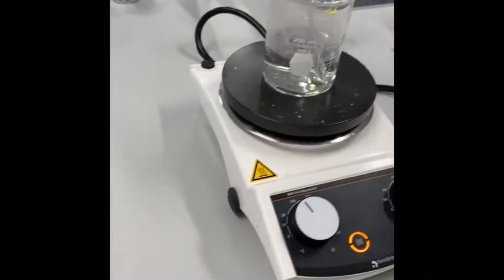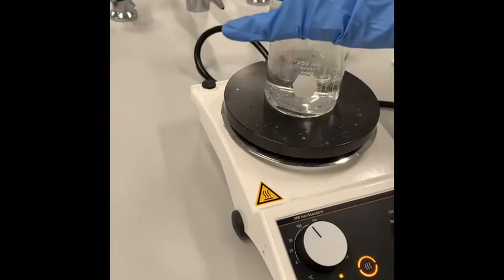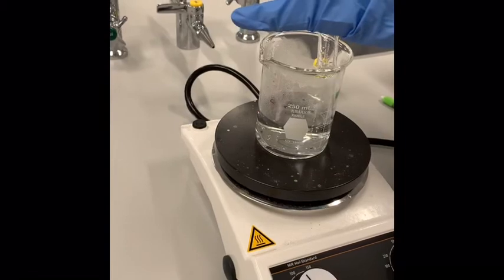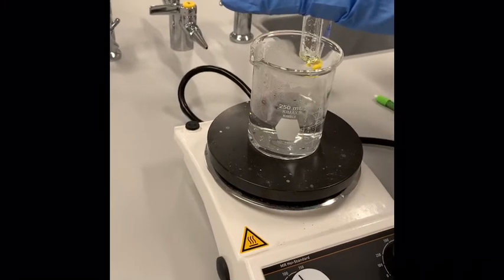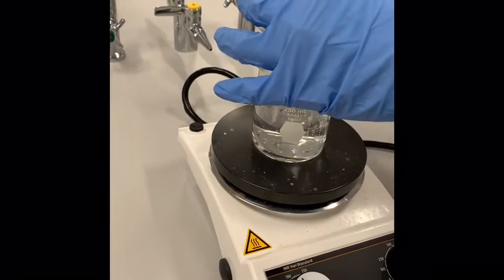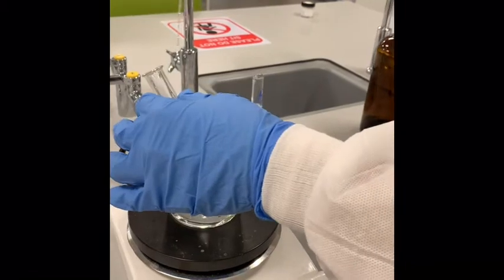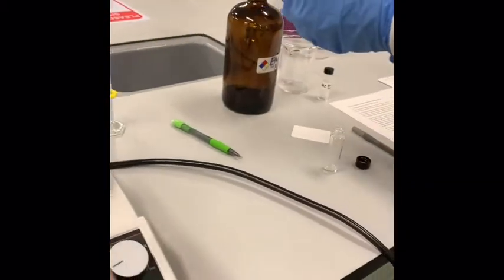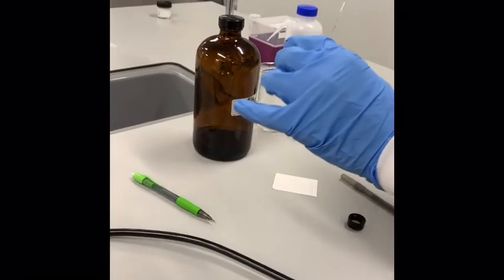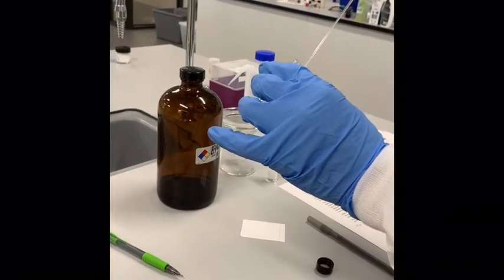We're going to take a drop of our reaction material. With the workup — this is an acid, so everything is protonated and dissolved in water. We'll get rid of about half of that. We're putting it into a little reaction vial and working it up with water.